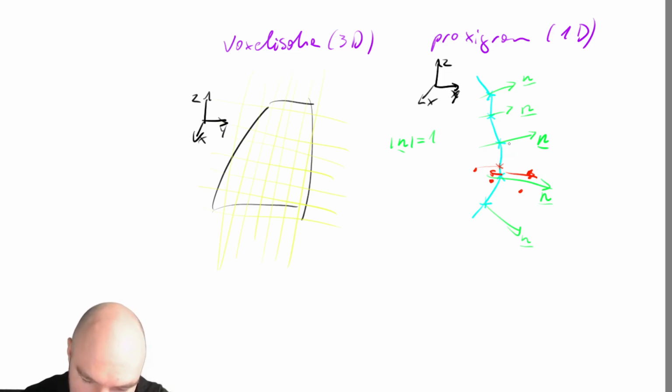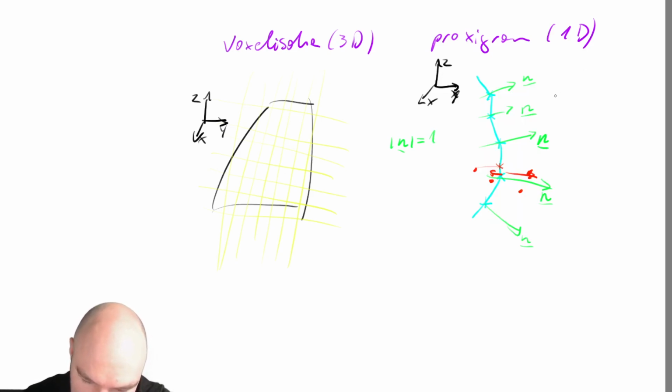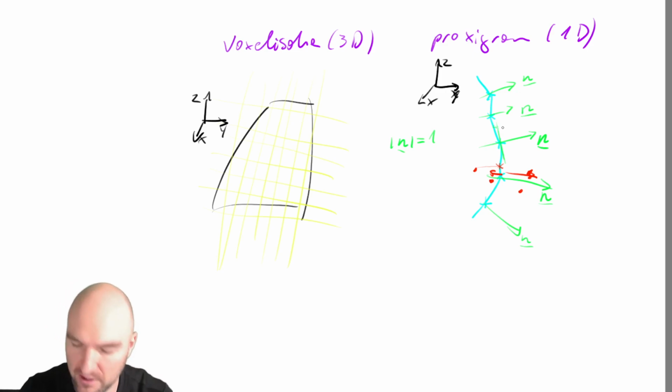The only subtlety is that the distance you're calculating is the distance to essentially this plane here. So if you have a strongly curved surface, the distance deviation matters. If your surface is not that curved, then it might not matter all that much.